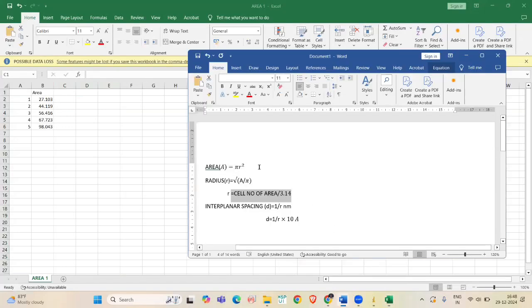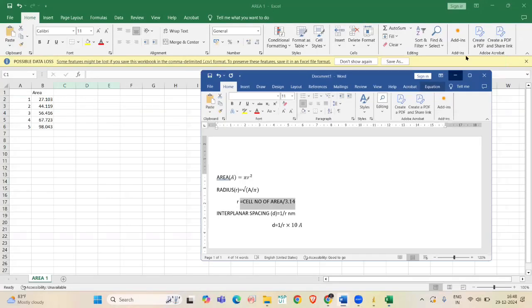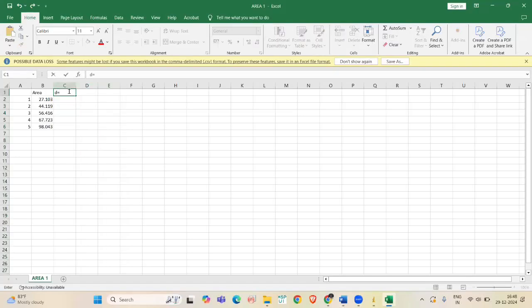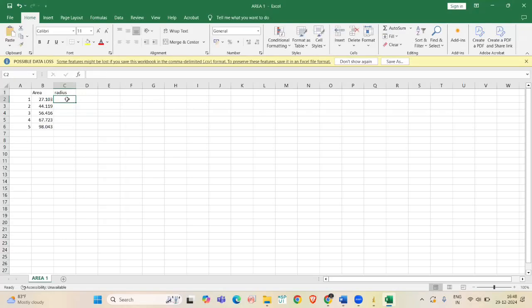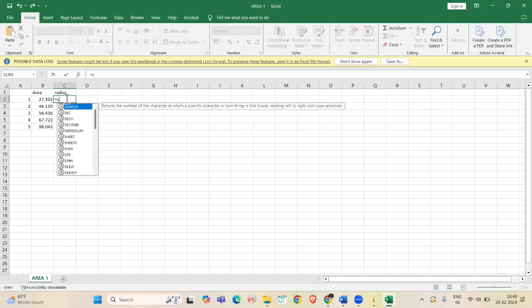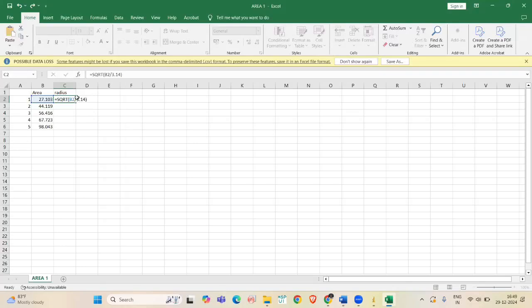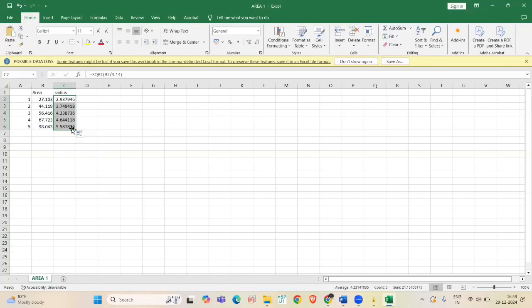Area of the circle is equal to pi r square. By this formula, we can derive the radius formula. R is equal to square root of A by pi. So now, radius formula is equal to square root of A by pi, which is the value. And I am just dragging it to all values.